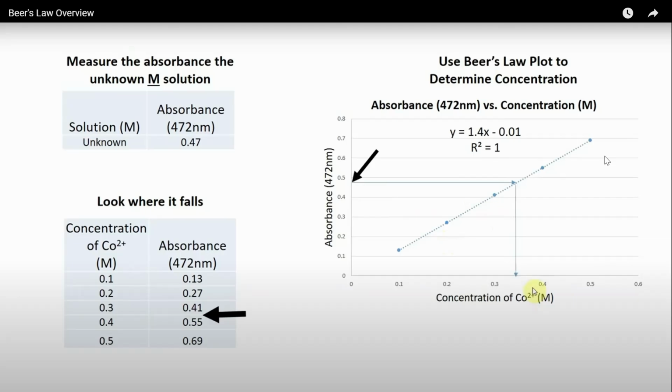So anything that's in there, cuvette, solvent, anything that absorbs at that wavelength will be zeroed out because you'll set the machine to 0. Are molecules in the solution going to absorb some of the light? Yeah, there's going to be various ones that absorb little bits of light, but not very much.